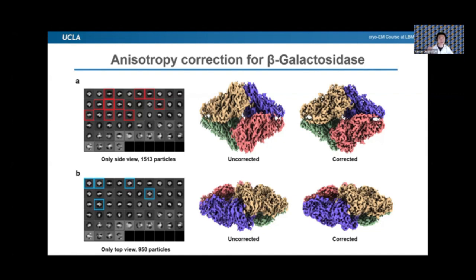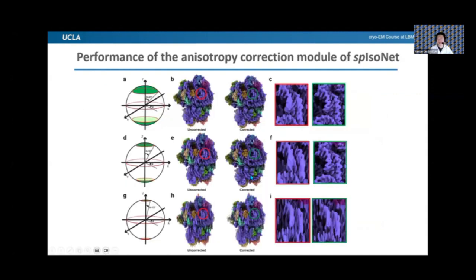And if your data set is not perfect, for example here, this is a single particle IsoNet because with that we can have a ground truth. If I have a 16 degree missing cone, the recovery is not very good.